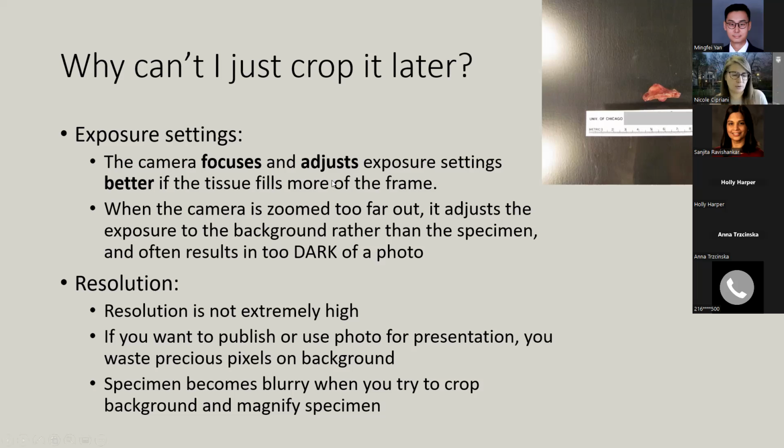Sure, you could crop it, but try it out. Take some images really zoomed out and really zoomed in on the same specimen, crop it and magnify it, and see if you lose information. That would be my recommendation. Those are my suggestions as to why I don't crop it later. Does that make sense?